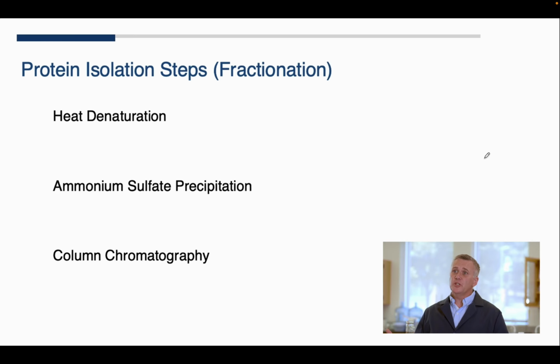And then, again, if we want to study GOT for some reason, for the urea cycle or something else, we would need pure GOT to study. So today, in these next two steps, part 1, experiment 6, and experiment 7, we're going to work with a couple of steps to help isolate GOT, and these are called fractionation steps. Fractionation is a term where we can fraction all of what's, say, in the pig heart cell into various components. Okay, we're going to fraction them.